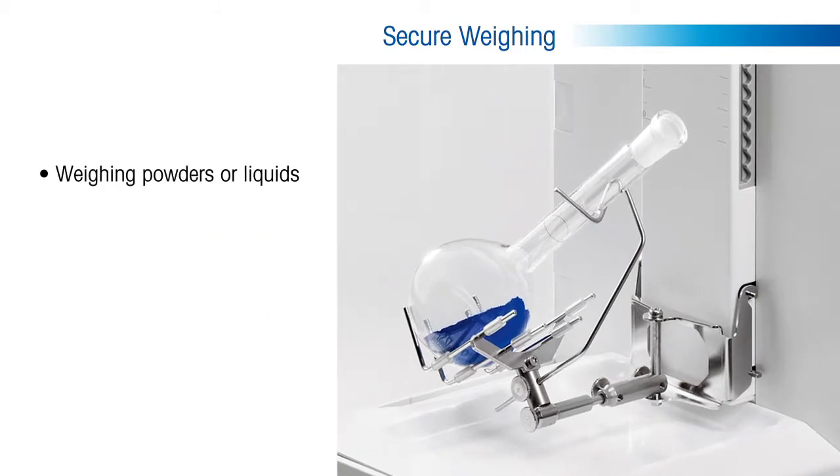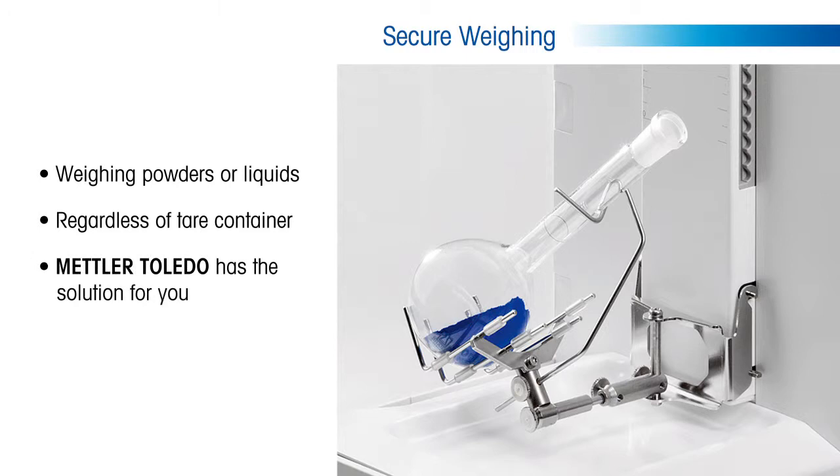The two varieties of ErgoClip either snap onto the existing smart grid or replace it with the same cantilever technology. Regardless of the type of substance you are weighing or tare container you are using, Mettler Toledo has the solution to ensure you are weighing samples securely and conveniently each and every time.